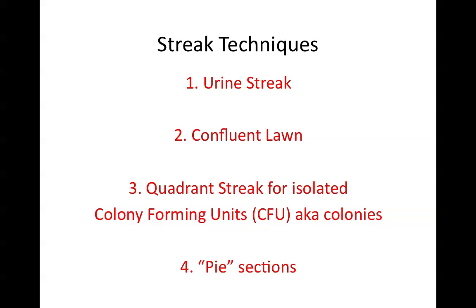Before we start lab this semester, a little practice with pencil and paper will get you prepared for what we will do in our lab activities. Practicing streak techniques is a very effective way of preparing for lab. We have 4 very different streak techniques that we use in microbiology. There are other types of techniques, but these are the ones that we will use this semester.